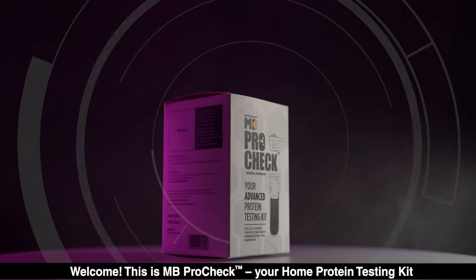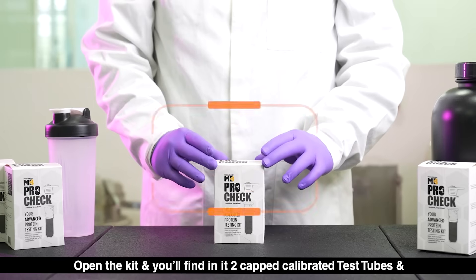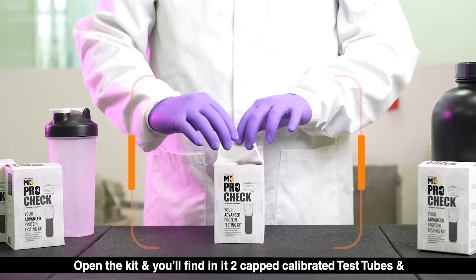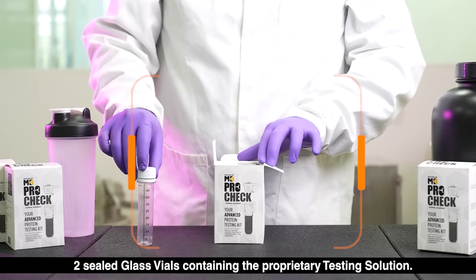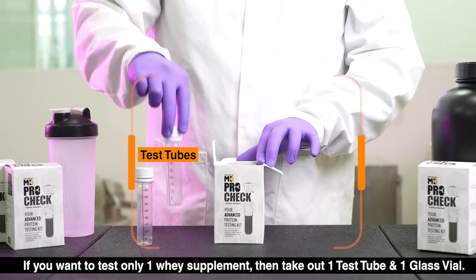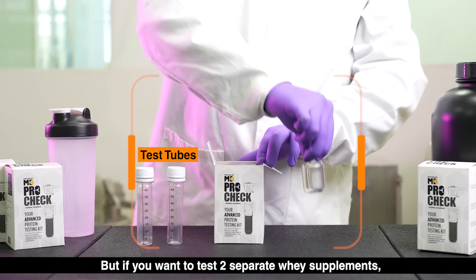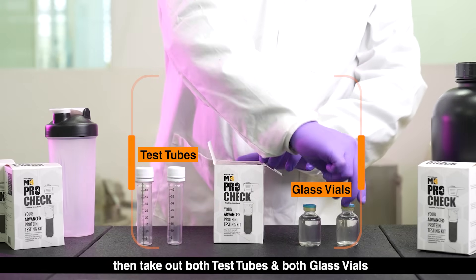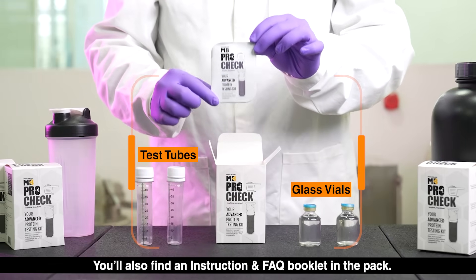Welcome! This is MBProCheck, your home protein testing kit. Open the kit and you'll find in it two capped calibrated test tubes and two sealed glass vials containing the proprietary testing solution. If you want to test only one whey supplement, take out one test tube and one glass vial. If you want to test two separate whey supplements, take out both test tubes and both glass vials. You'll also find an instruction and FAQ booklet in the back.